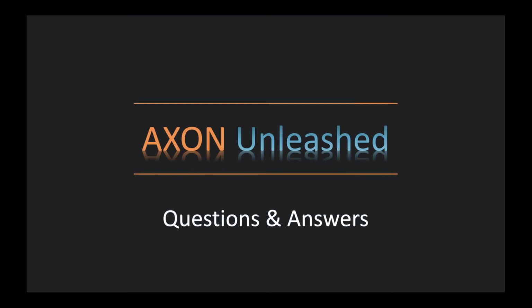All right, thank you, David. Don't take off your product manager hat. I think this question is probably best suited for you as well. In one of your heating videos, AXON seemed to follow a particle as it was moving on the carbon. How does the user decide what the drift correction operates on?